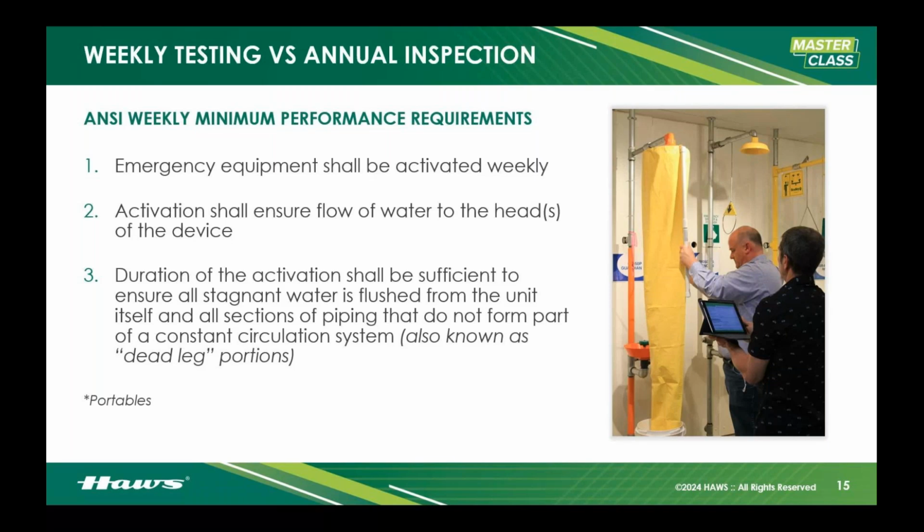I know it's difficult, but these tests can take a couple seconds. It really depends on the type of emergency equipment you have in place, but all that's required is that you visit the unit once a week. I suggest early in the morning, whenever somebody immediately gets there, but probably Monday morning, if that's when your work week starts, just to ensure that the equipment is already checked for the week.